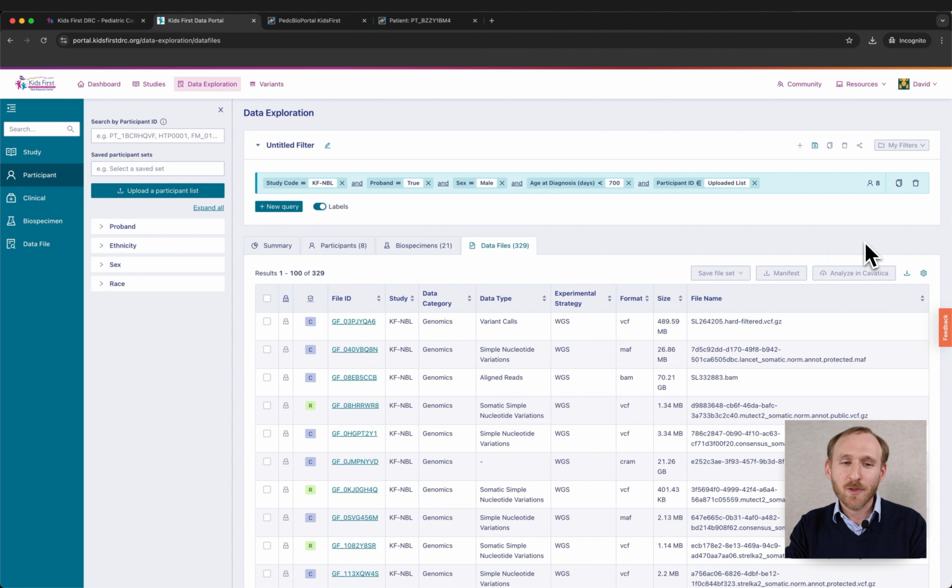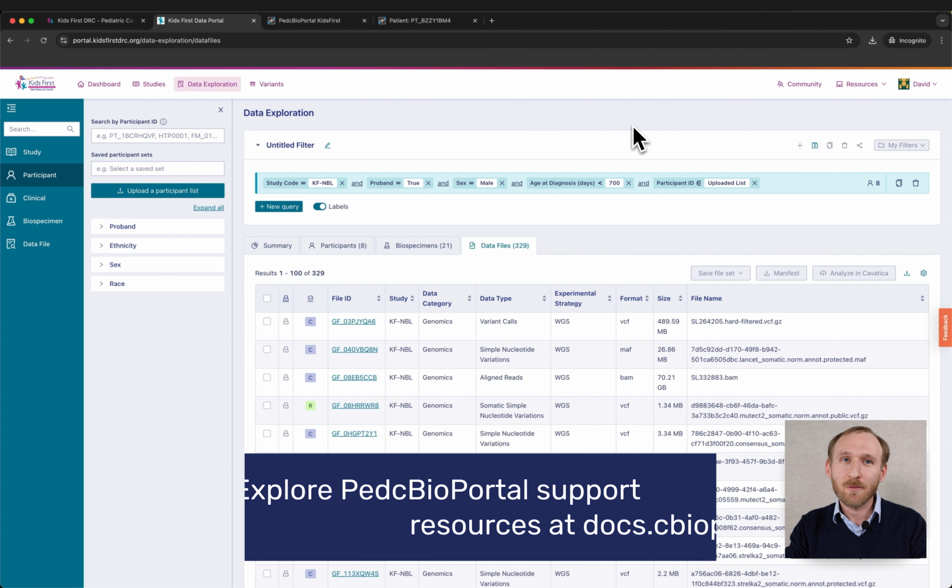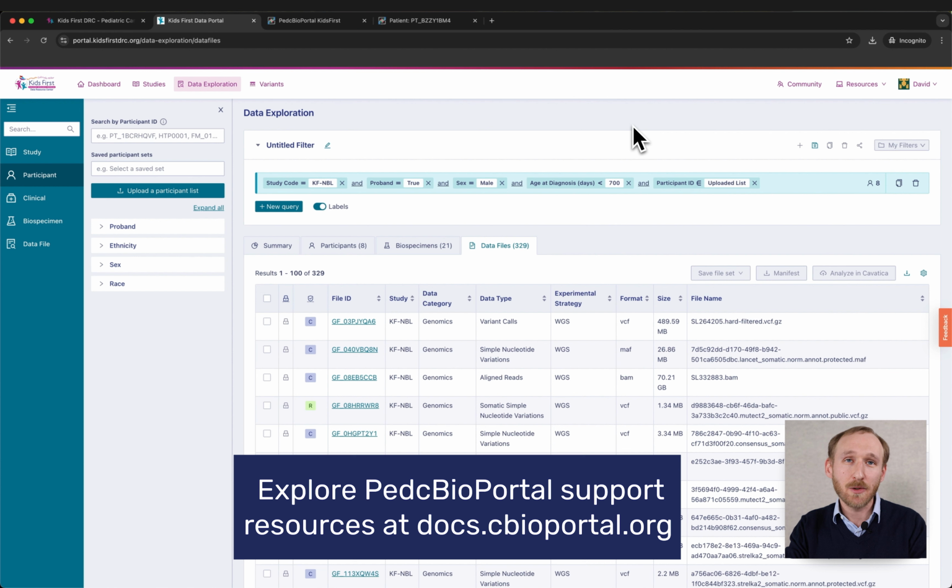But we're only scratching the surface of what you can do in PedcBioPortal. For additional support and resources on how to use PedcBioPortal, check out the links in the video description.